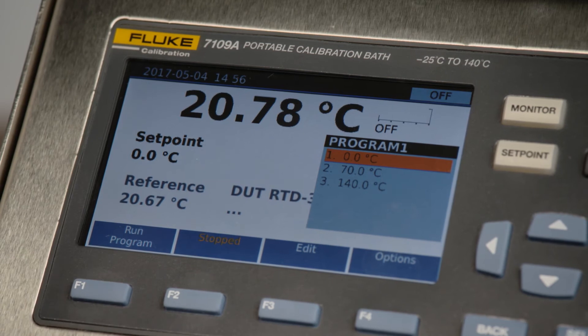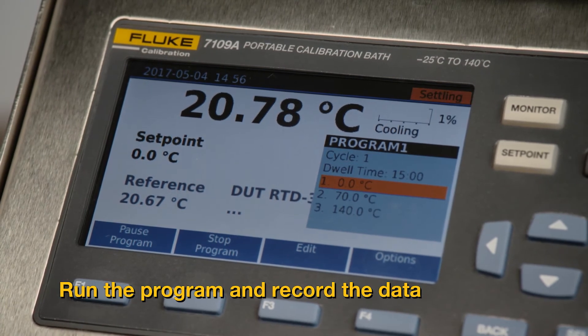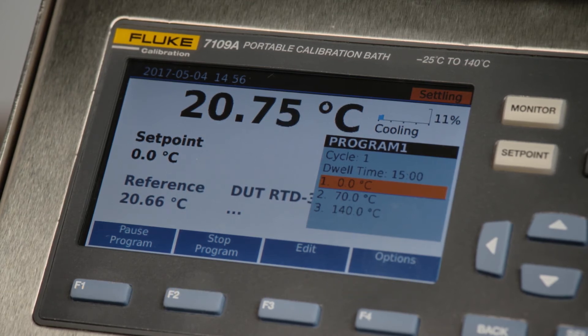Select program one, then hit run program. The bath will begin cooling down from room temperature to the first set point, which we have set for zero.